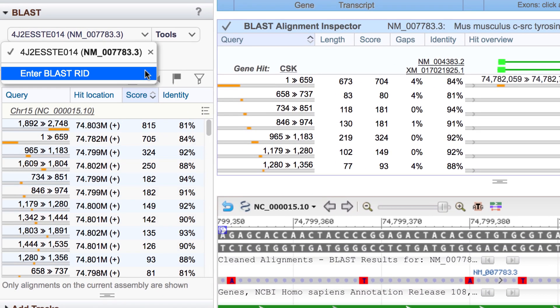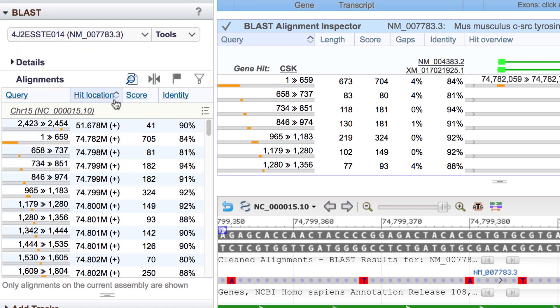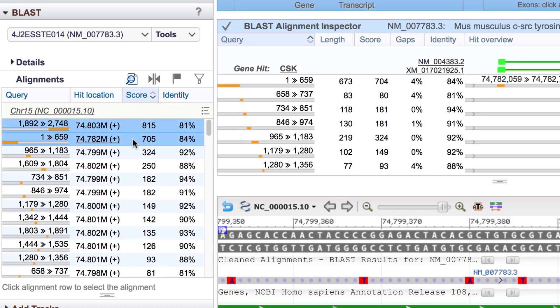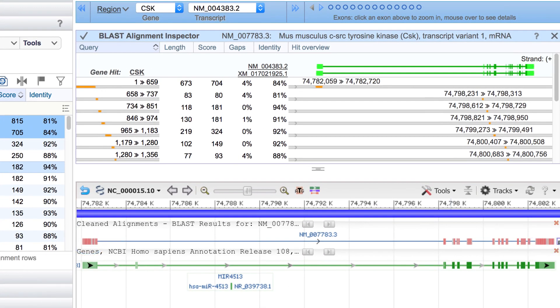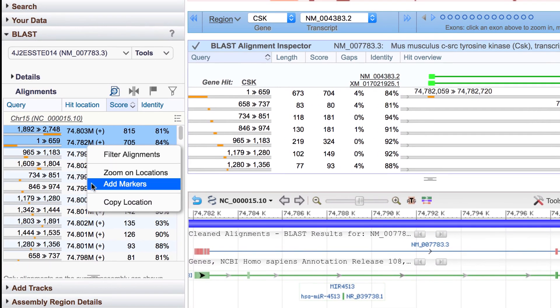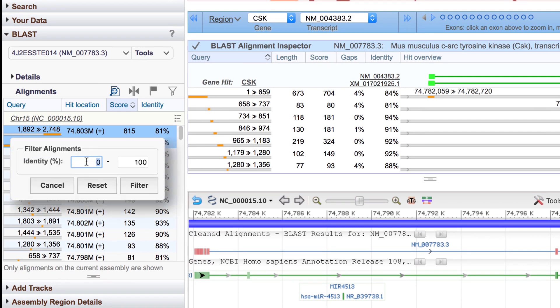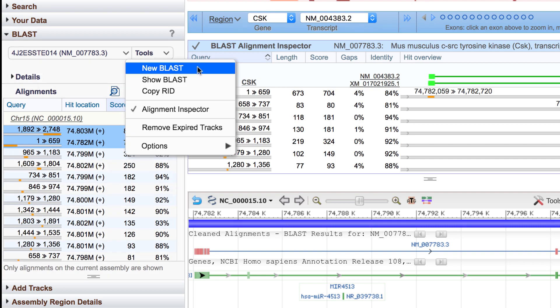The BLAST widget offers another way to load BLAST results, by entering a BLAST RID number. In the Alignment section of the widget, you can sort the alignments, and zoom to one or more selected alignments, add a marker, and filter by percent identity. You can also initiate a new BLAST search from here.